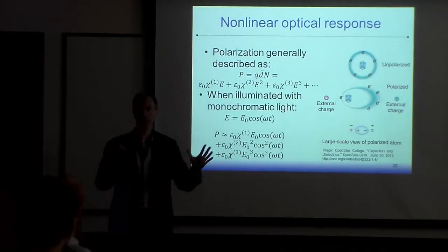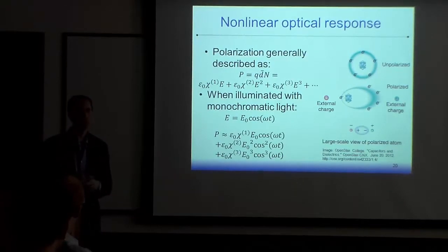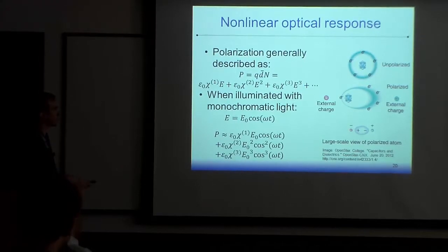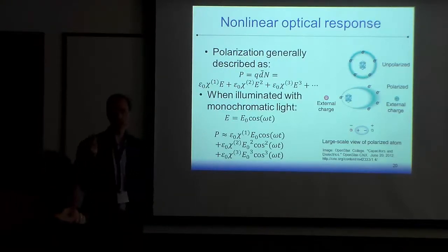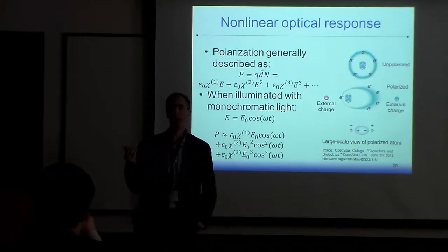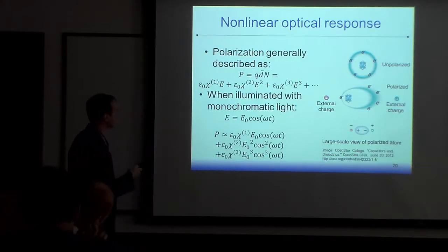And I don't know how much background we have in nonlinear optics, so I'll give a four-slide crash course in nonlinear optics, so you can get an appreciation of where this comes from. We can start off with a purely classical point of view and say, okay, we have some electrons, and we can put an electric field across them and separate them out like a dipole. If you put a positive field here and a negative one there, electrons will move over towards it, and you end up with a positive charge on this side and a negative charge on this side, and your neutral molecule is now a dipole. It's basically like a mini antenna. So we want to study how these dipoles can be formed, and what the frequency response of these dipoles is, and that can get us information on what light can be radiated by these dipoles. Okay, so let's look at the polarization.